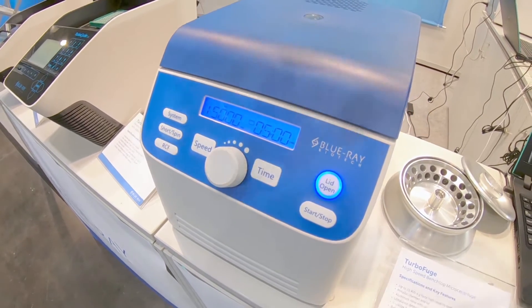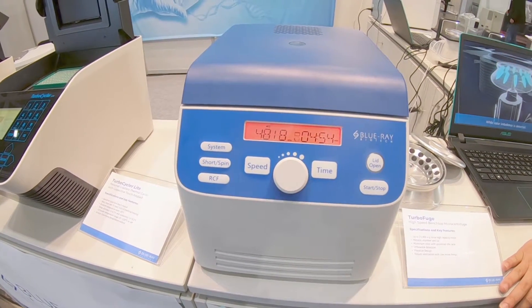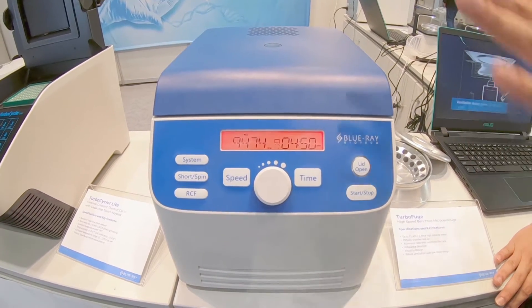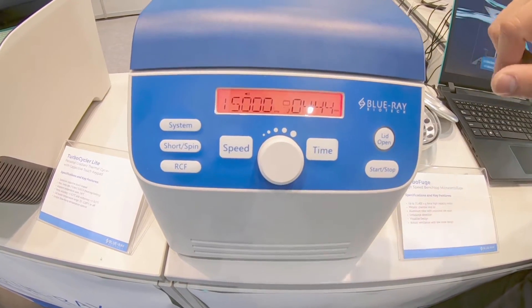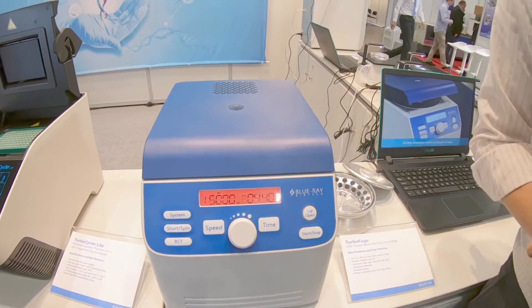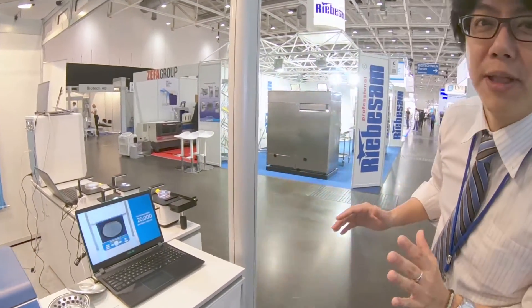Just close the lid and it starts. The speed is very high — up to 21,400 G, which means around 15,000 RPM. Please check the noise. Right now it's up to maximum speed and the noise is very quiet. Honestly, this product is very competitive and can compete with some famous big brands like Eppendorf.